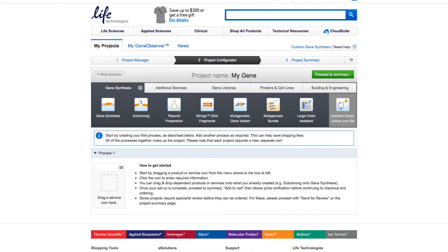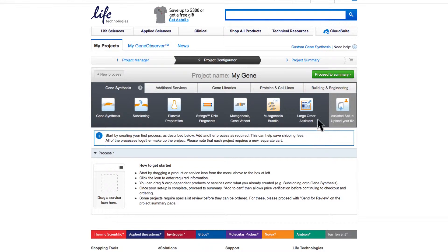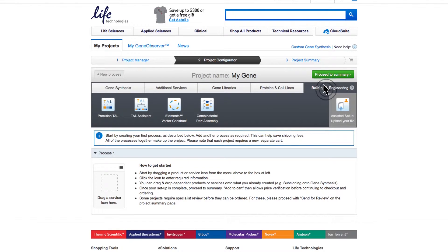Genart Elements Vector Construction. To set up your vector construction project, click on the Building and Engineering tab within the Project Configurator.